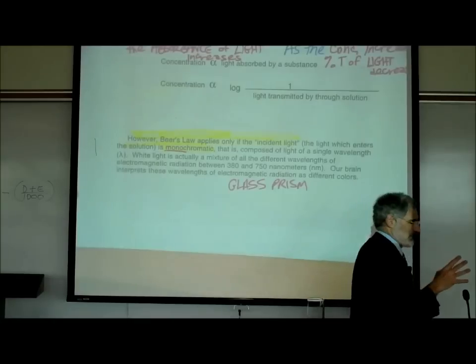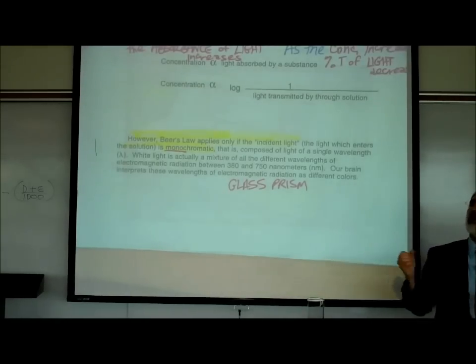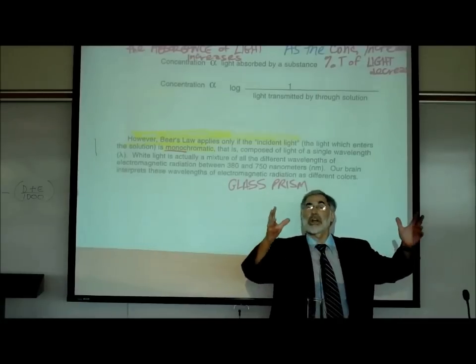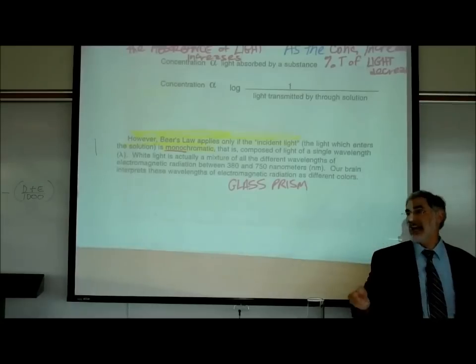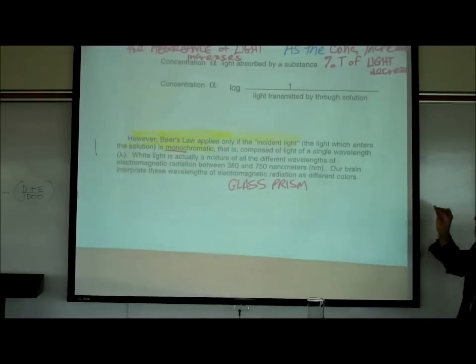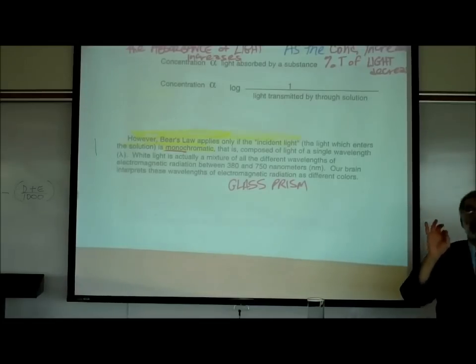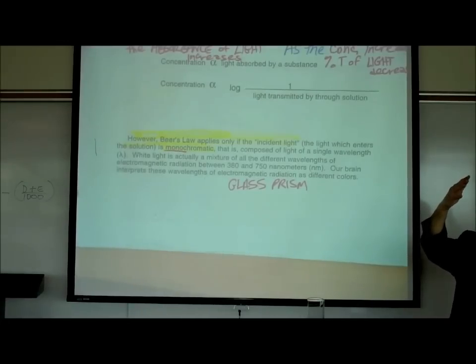The point is this. Different atoms and different molecules absorb and emit different colors of light. So certain colors of light work better in being absorbed by certain atoms and molecules than other colors of light. So this method only works when you're using the right color of light to cause the electrons to absorb that energy and move to higher orbital levels.